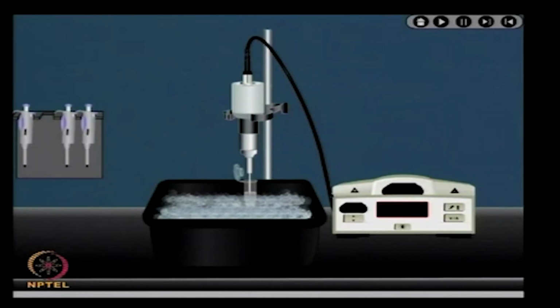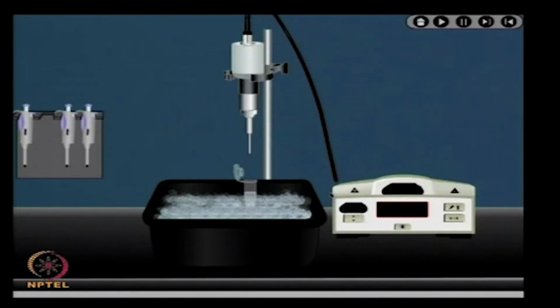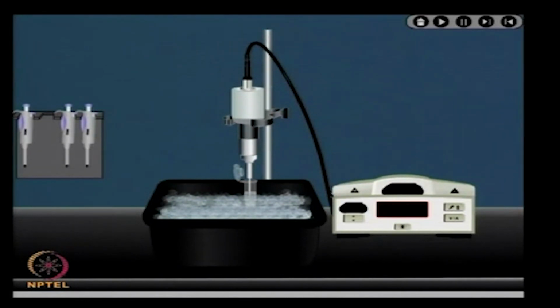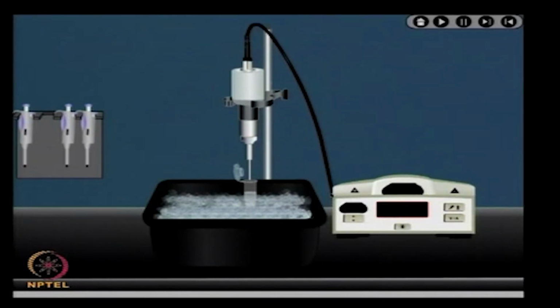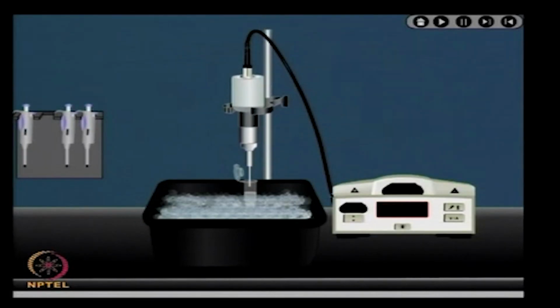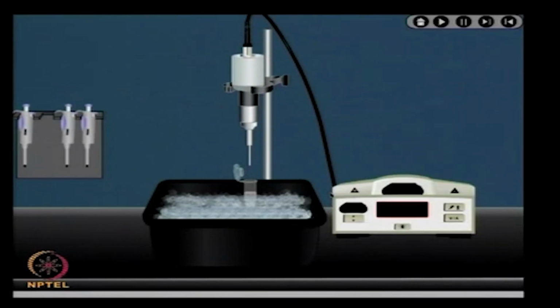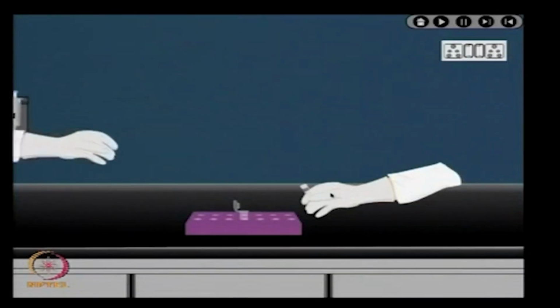Mild sonication is performed using a sonicator for 6 cycles of 5-second pulse with 30-second gap in between at 20% of amplitude. The mild sonication step in serum sample is found to be effective in improving the gel quality and resolution.